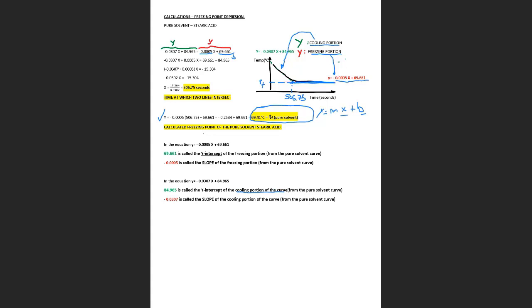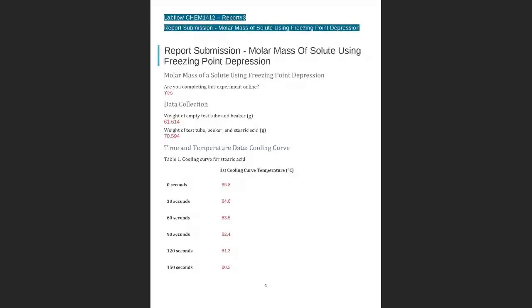Not right now. Okay, and then, if this is clear, I will share. So this is kind of how your reports are going to look. Every person has different data. They are going to give you the data, and they are going to say the first cooling curve.